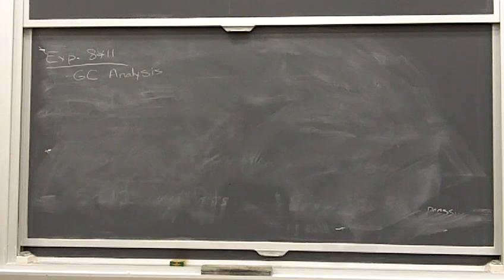So the heptenes are in the mid-2s or so, 2 minutes. The octenes are in the 4-minute range. If you have a peak that's in that range, but you haven't identified it, more than likely it is some sort of alkene, so you need to give a best proposal for what it is, even if it doesn't fall on the standard retention times, okay?